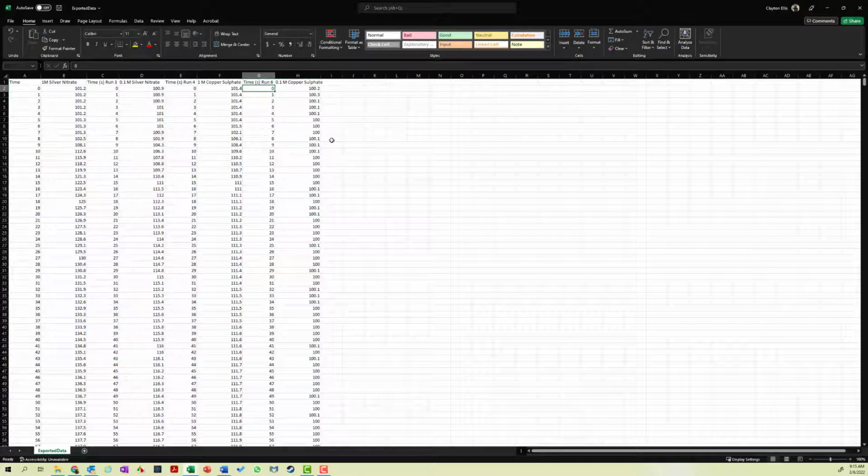So I have all the data. And you have to determine what the runs are. You have to tell everybody. You have to put that in there. So once you have this data in here, you could save it. So I'm going to save this.